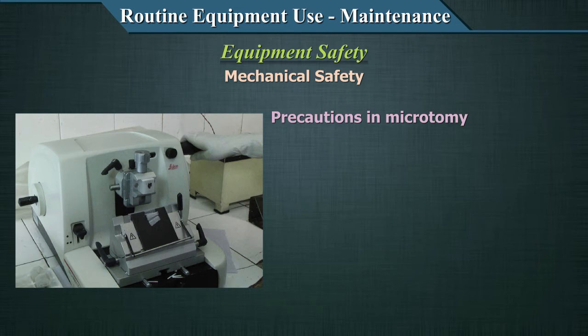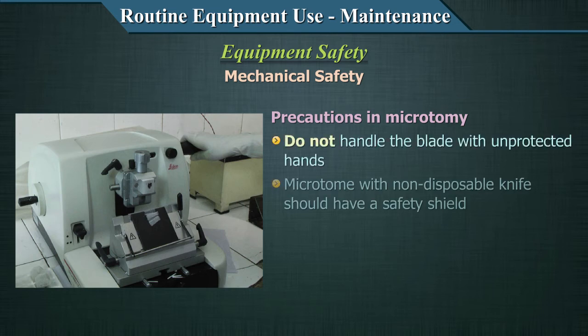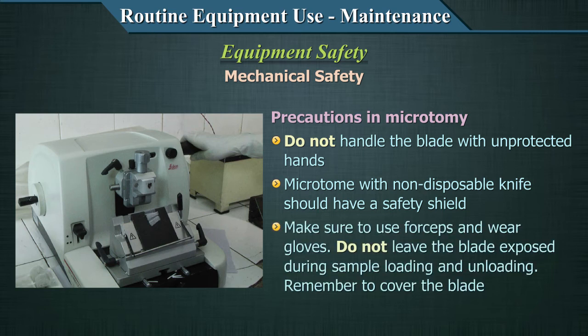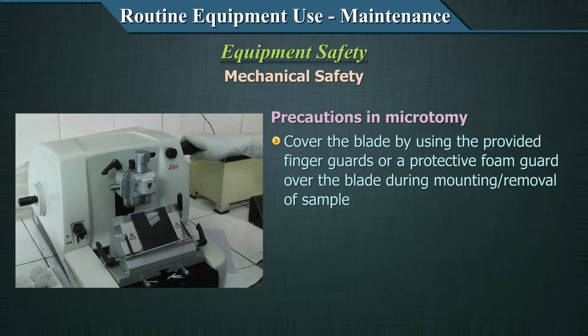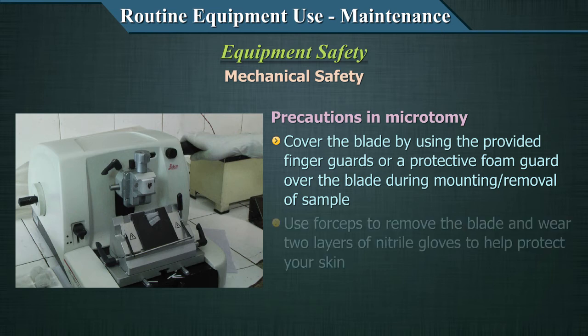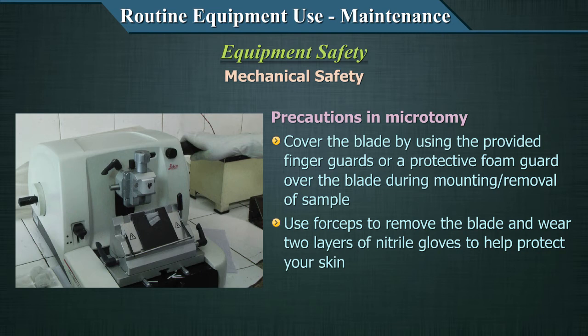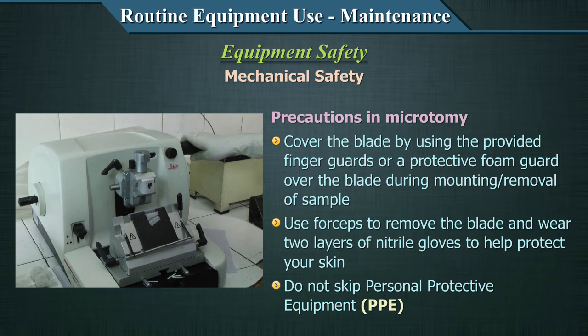For microtome safety: do not handle the blade with unprotected hands. Microtomes with non-disposable knives should have a safety shield. Use forceps and wear gloves. Do not leave the blade exposed during sample loading and unloading — always remember to cover the blade using provided finger guards or protective foam guards during mounting and removal of the sample. Use forceps to remove the blade and wear two layers of nitrile gloves to protect your fingers.